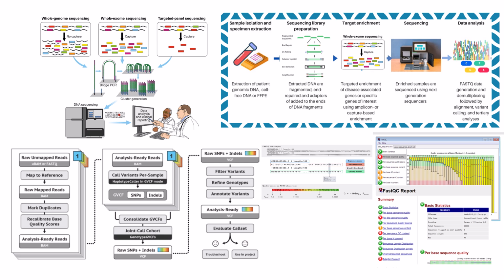Precisely. This whole phase is about bridging that gap from raw genetic code to clinically interpretable information. Wow. Okay, that is a truly complex, multi-step journey we've followed. Billions of reads down to a focused, annotated list of potentially significant variants. So what happens after all that computational heavy lifting finally finishes? What are the final outputs?